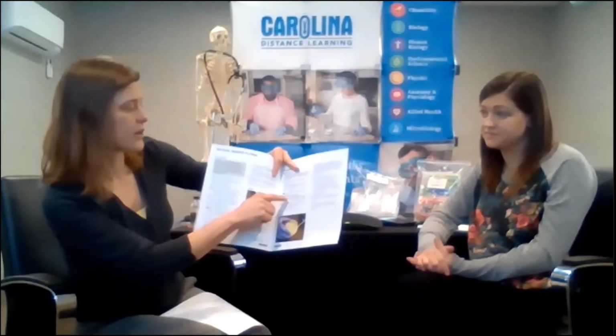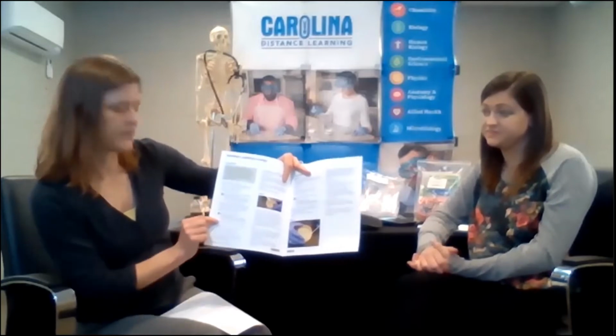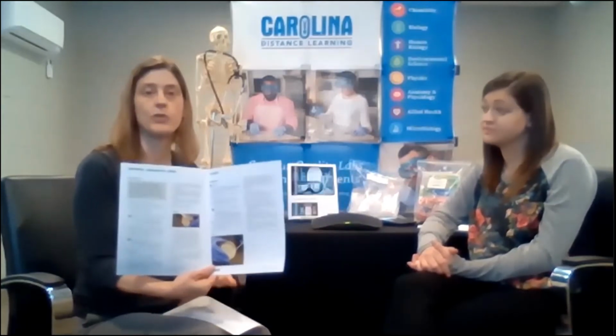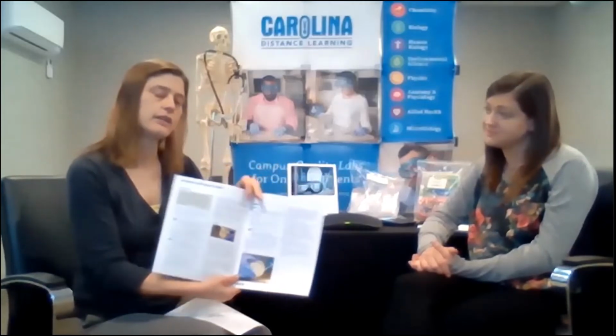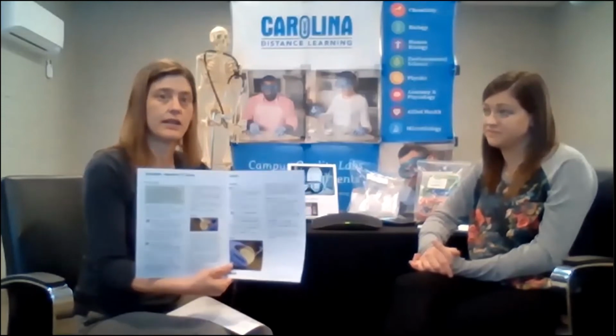And in these, there are links in some places to videos. It's got a little play icon, and then it has a link to a video. So for example, how to make a surface disinfectant. How do you make a 10% bleach solution? How do you use it? How do you use sterile inoculation tools? So there are procedural videos. What does it look like when someone does this? And that gives students a little bit more guidance.